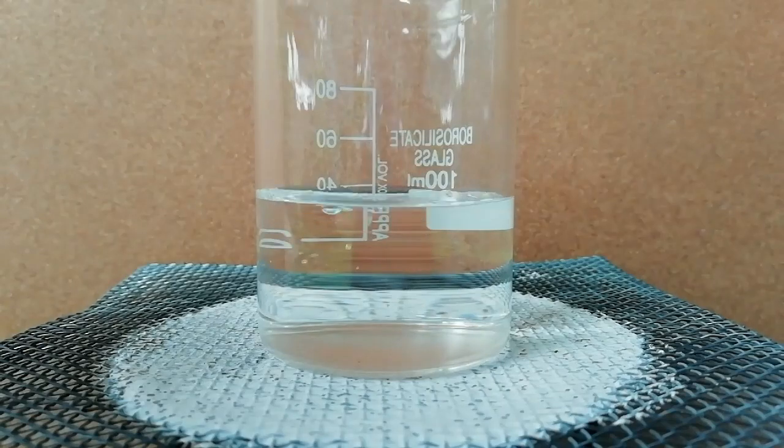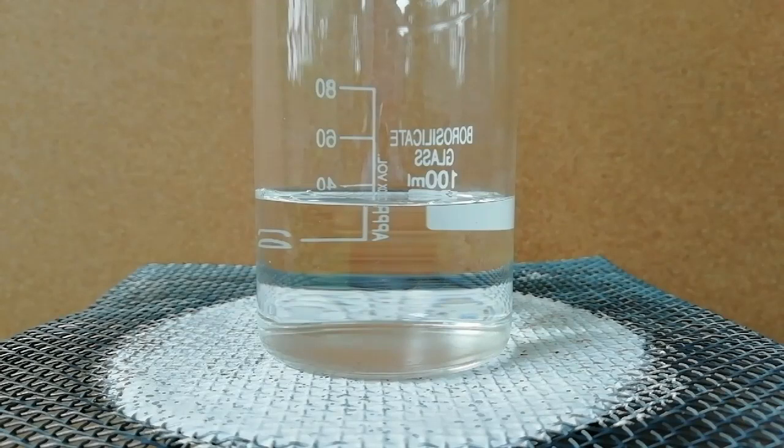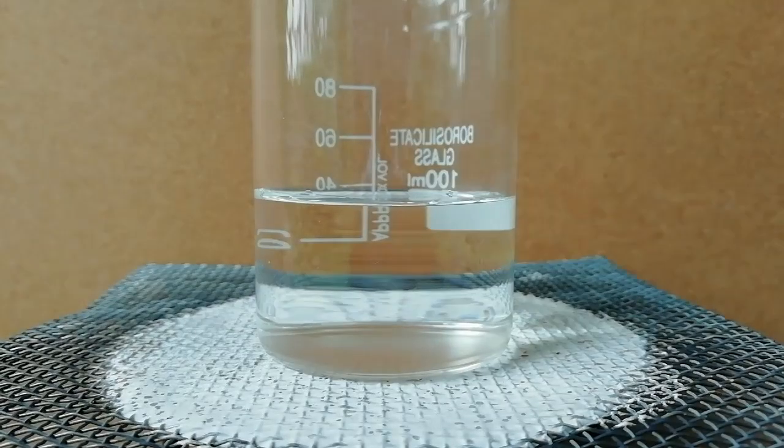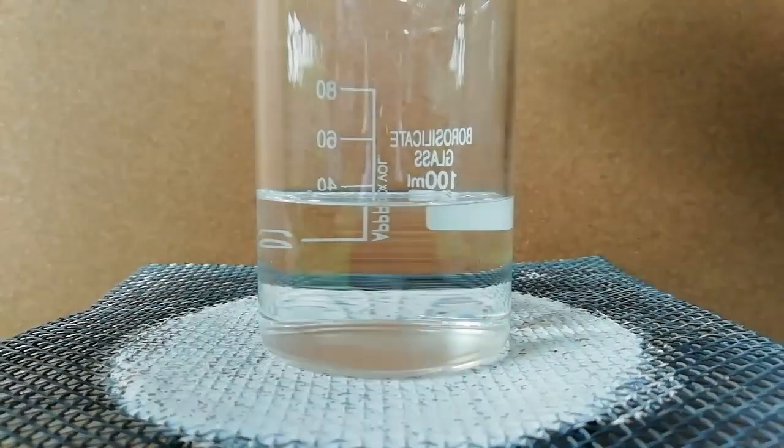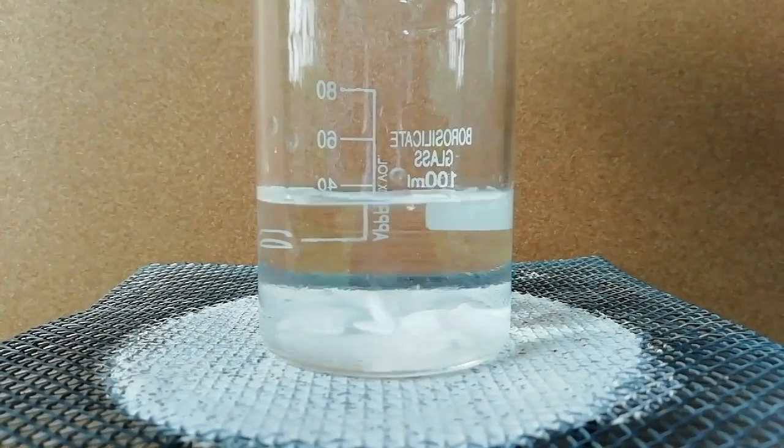To start the reaction, I added 40 milliliters of distilled water into a beaker, then I dissolved 2.6 grams of potassium hydroxide. Then I started to heat the beaker, after that I added iodine crystals slowly.